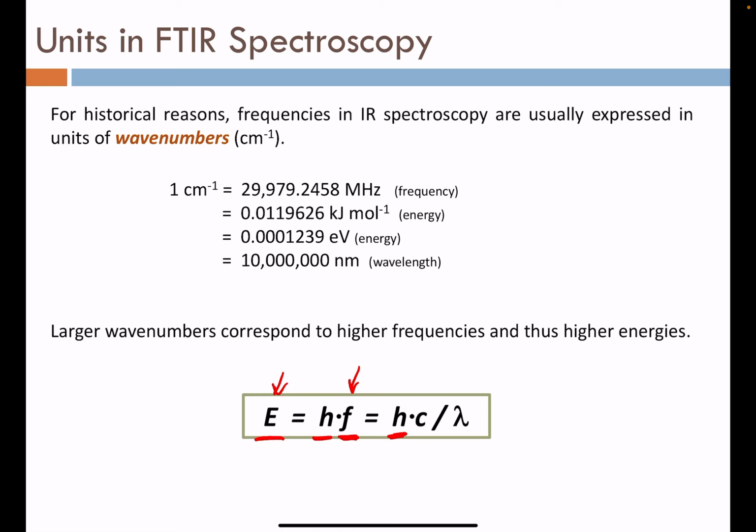We can also use Planck's constant and the constant for the speed of light in vacuum, and those come together as a numerator against a denominator for the wavelength for the same energy equation. Once the wavelength is known, if we simply invert that, we have reciprocal meters, and of course that can be transformed into reciprocal centimeters to help us.